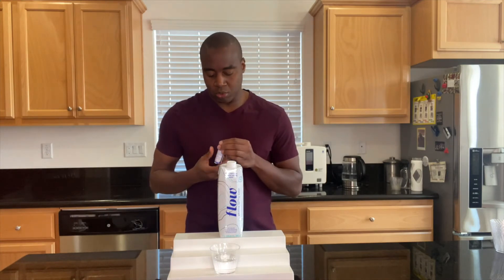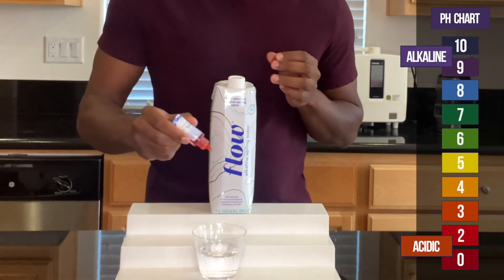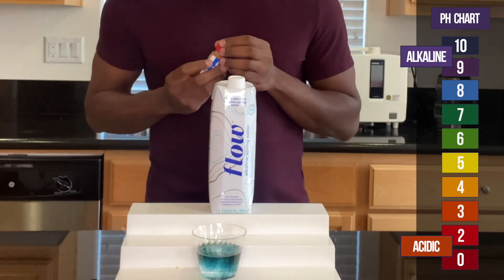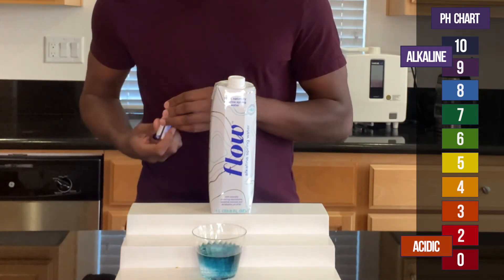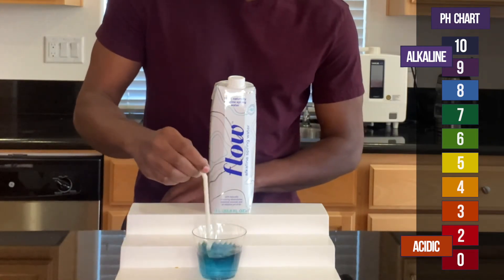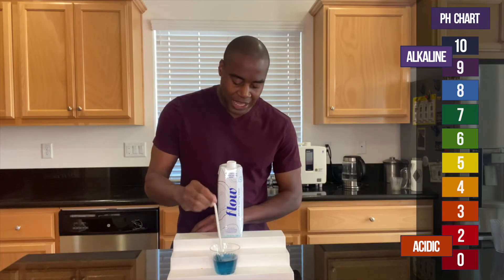So let's see what we get. Boom! It is looking like a blue — 8.1.